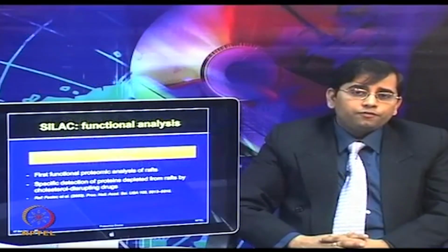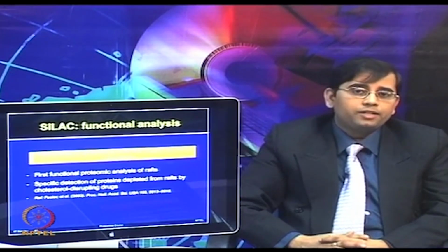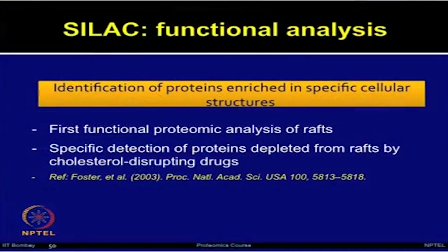The identification of proteins which are enriched in specific cellular structures. A study by Foster et al. used the first functional proteome analysis of rafts, and they showed the specific detection of proteins depleted from the rafts by cholesterol disrupting drugs.